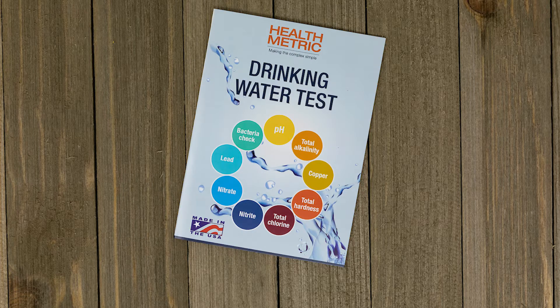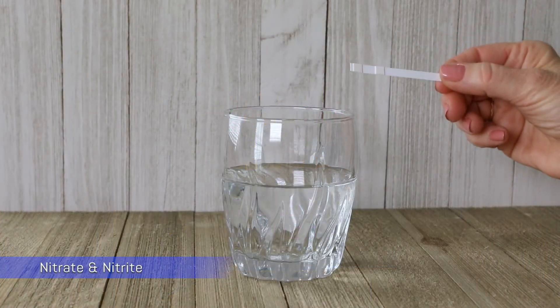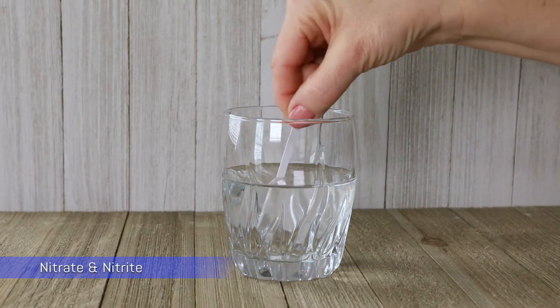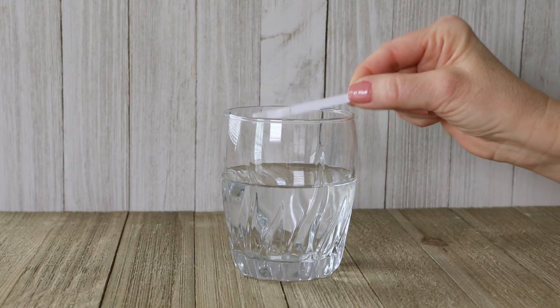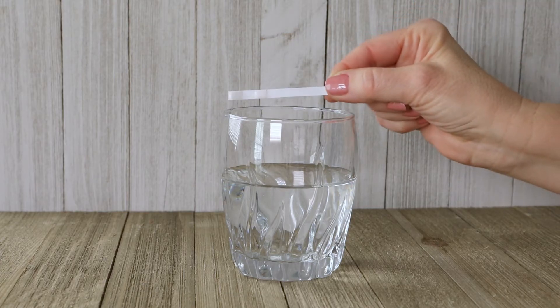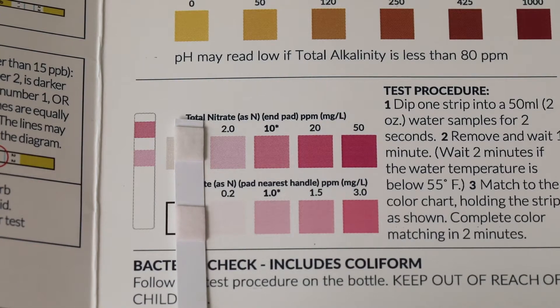The testing guide provides step-by-step instructions for using the kit. Test for nitrate and nitrite by dipping the strip into two ounces of water. Remove and wait one minute for the color to develop, then match the strip to the color chart.